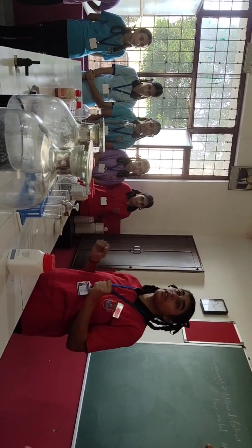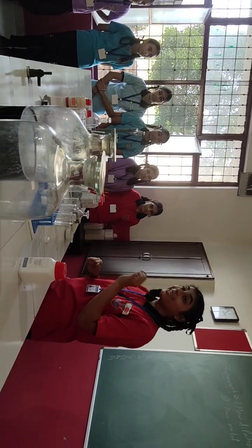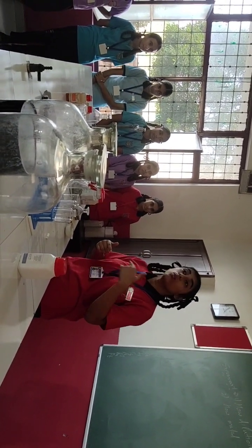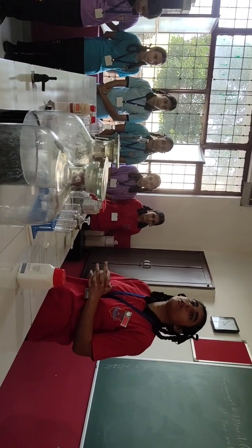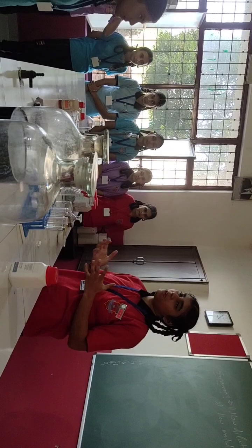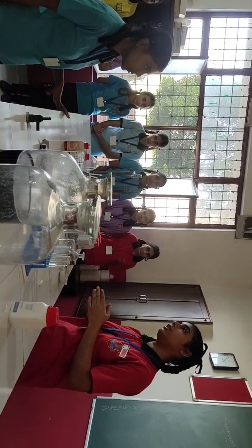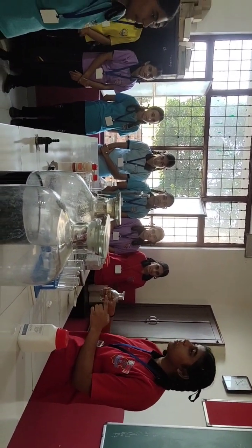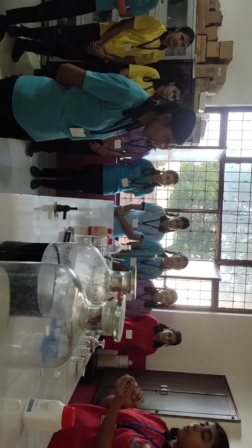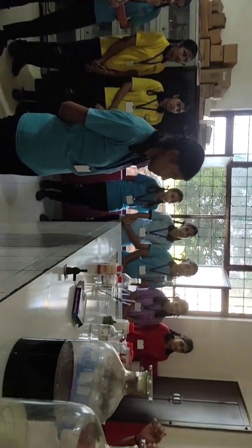For the dilution of acid, if we add acid into water drop by drop, then it can be diluted. But if you add water into acid by chance, it will cause heat, and due to the exothermic reaction, your beaker can also blast. It can harm us too. Yes, definitely it can harm because concentrated HCl can harm. By chance, if it fell on your skin, it would burn your skin and even your bones.